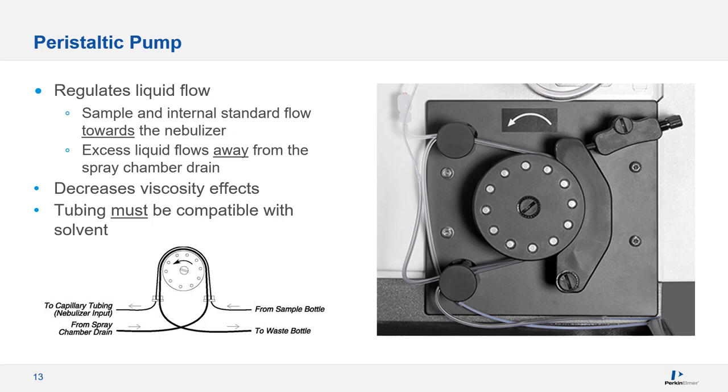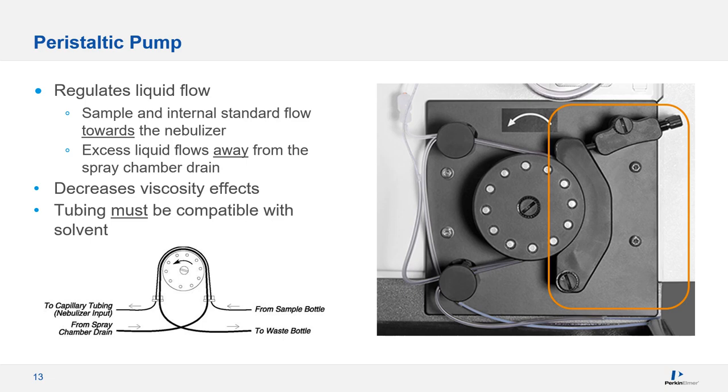Once the bubbles have made it past the pump head, loosen the tension on the clamps until the bubbles stop flowing. Then tighten them until the flow of the bubbles is smooth. You don't want to over-tighten the tensioning clamps, though. This can inhibit or even stop the flow completely and cause premature wear on the tubing.